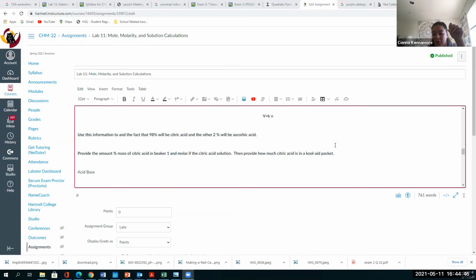Okay. So I did it again for the baking soda, and the strip pretty much worked. It gave me like a green, so I put like 11, and then the cabbage gave me a blue, like an 8. Okay. So that one works, but then I did vinegar again, and it's still kind of giving me more of an orange yellow. Should I just assume it means more of an orange red? Orange yellow? No, it's fine.